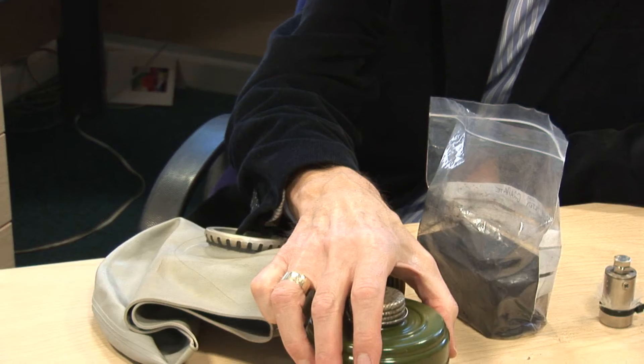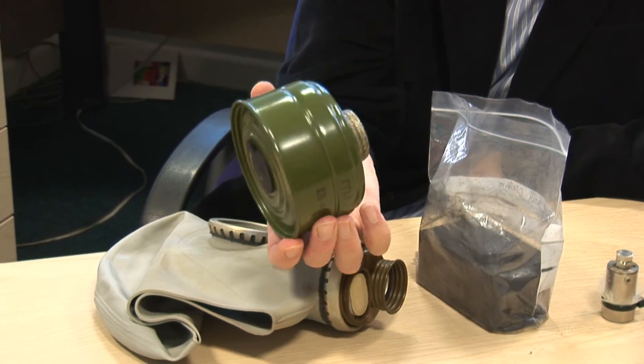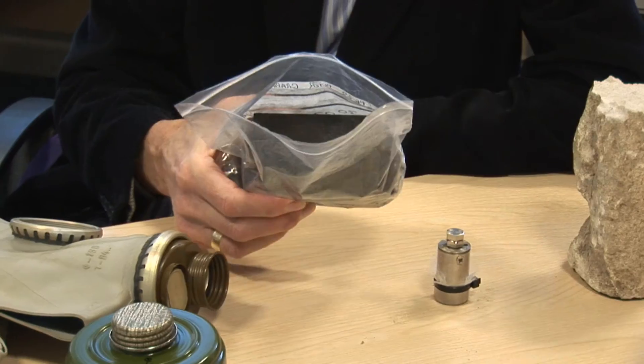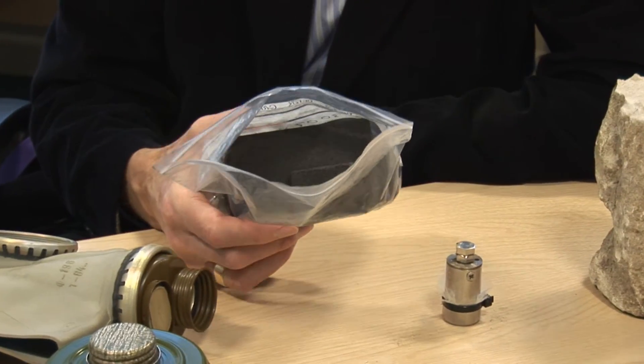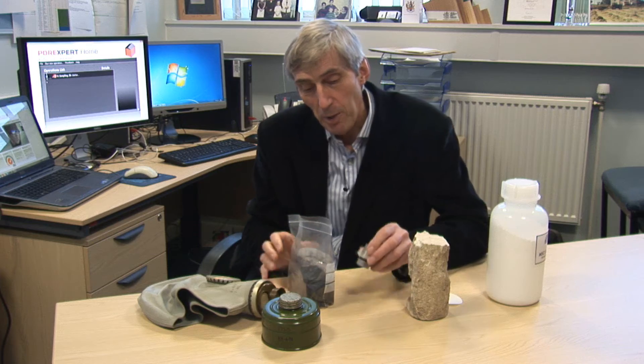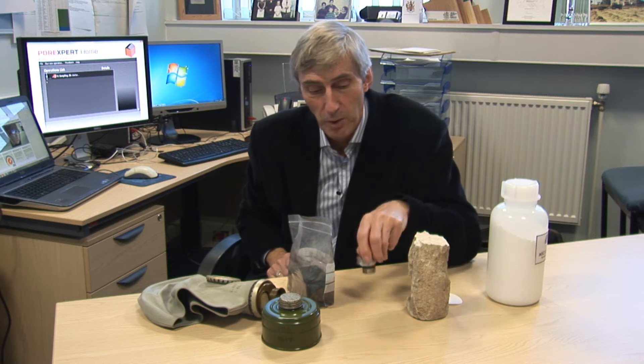It could be any porous material, a gas mask filter, it could be graphite from a nuclear power station, maybe a powdered sample, powdered soil and repacked.